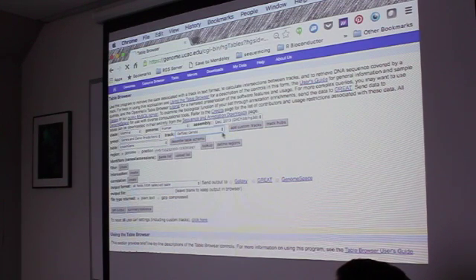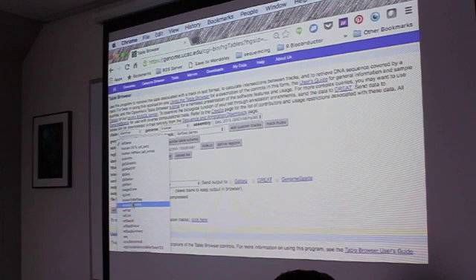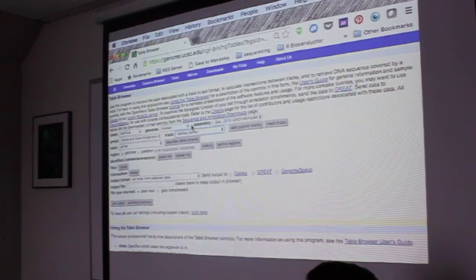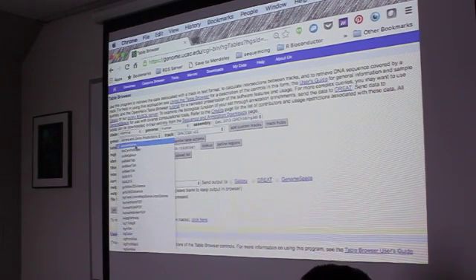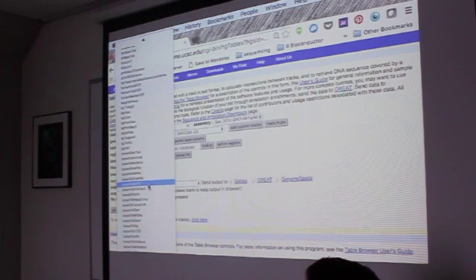Let's say RefSeq. Within this, you can choose the table type, like is it refGene or is it refFlat. I usually end up choosing refFlat. What is refFlat? It's a format, the way the data will be in. You could also go with, let's say, we choose GENCODE here. Then see how this changes based on that. So you could choose whichever other variation you want from this. Sorry, what is GENCODE?